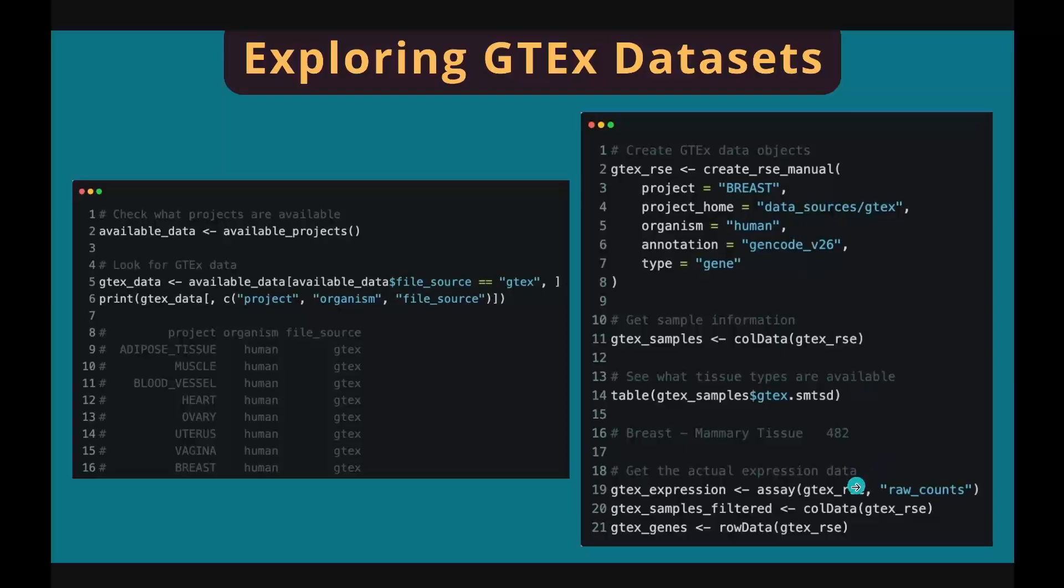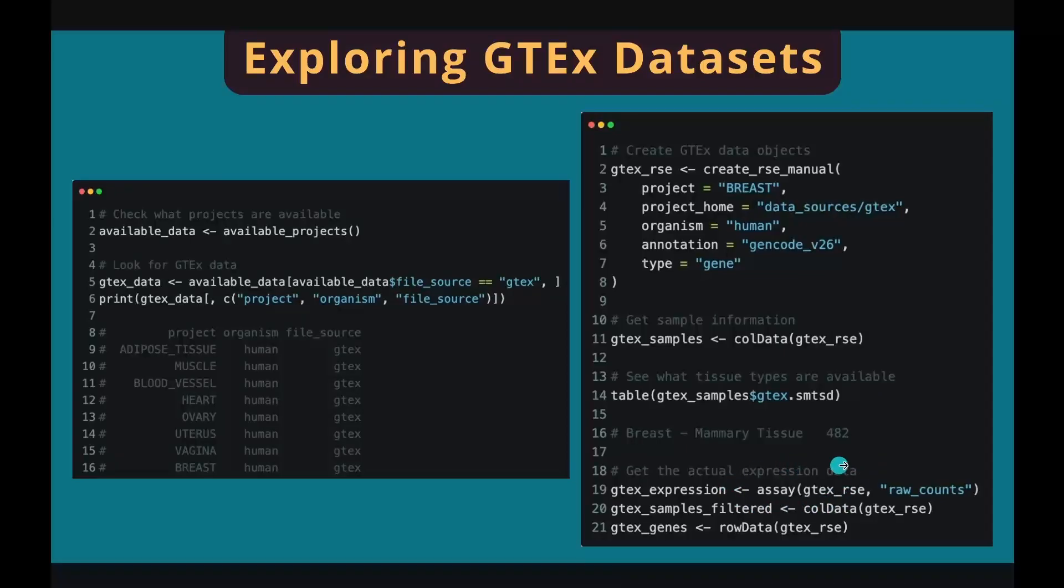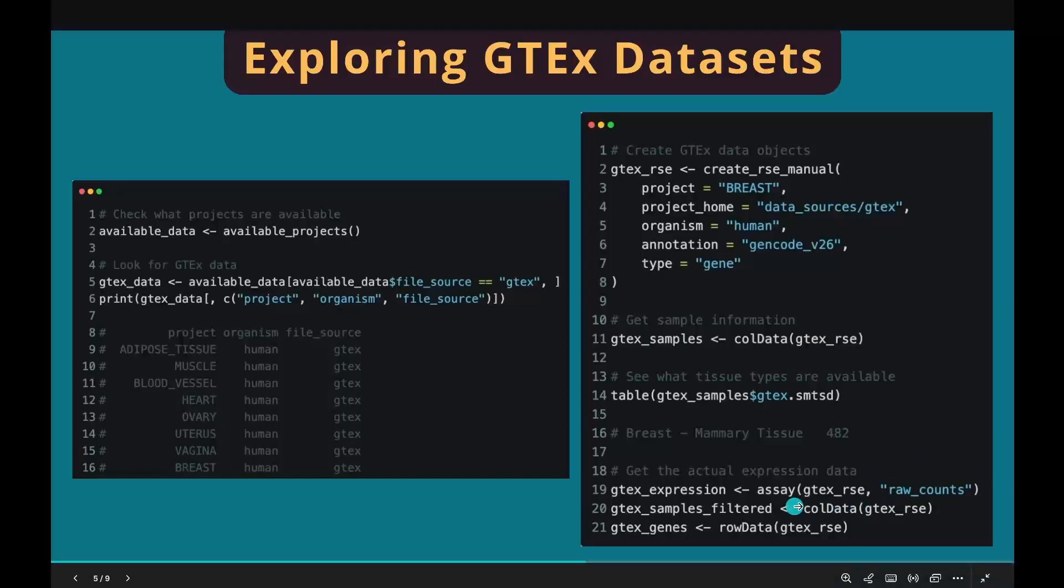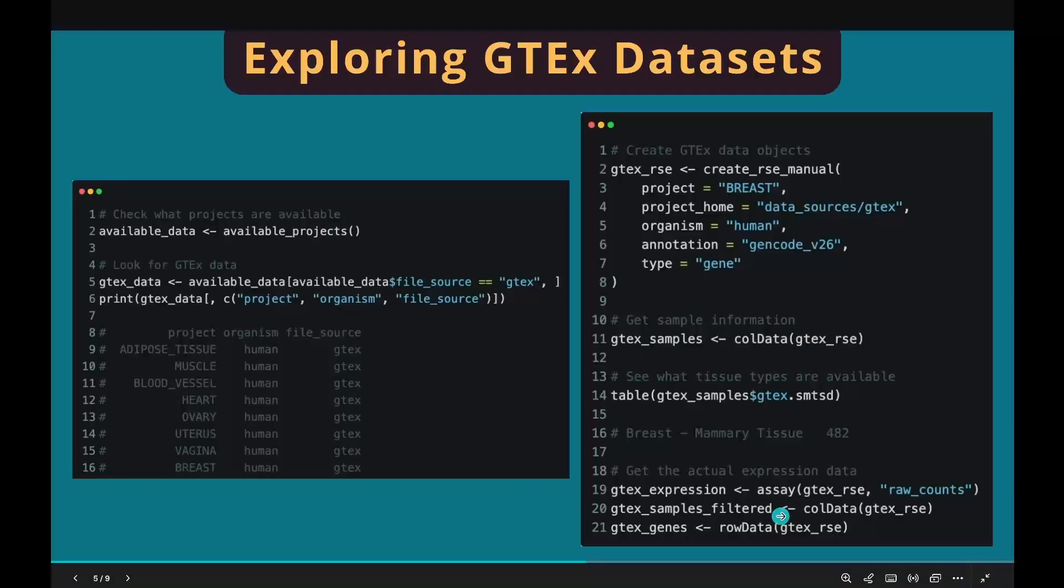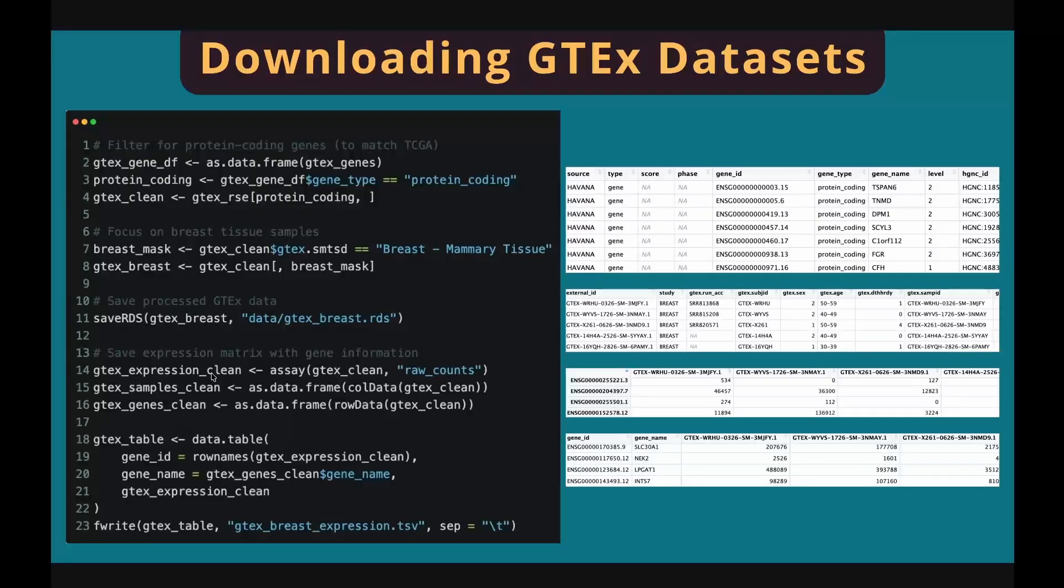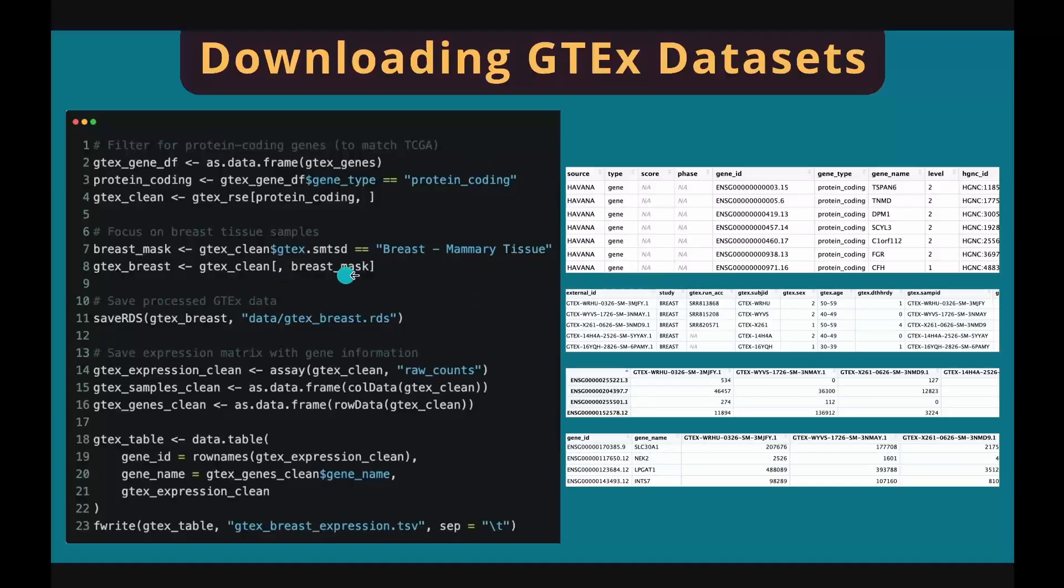Similarly, we use assay function to extract gene expression matrix. Make sure you use raw counts to download the count table. Use colData function to retrieve the sample information, and use rowData function to retrieve the gene information. As in TCGA, you can choose what kind of genes and what kind of samples you want to keep in your dataset by subsetting the R object.